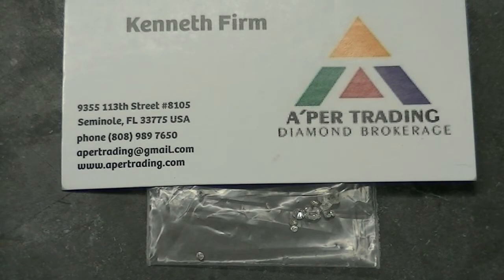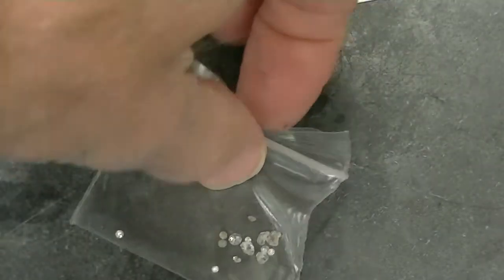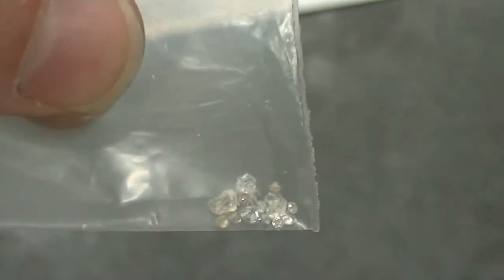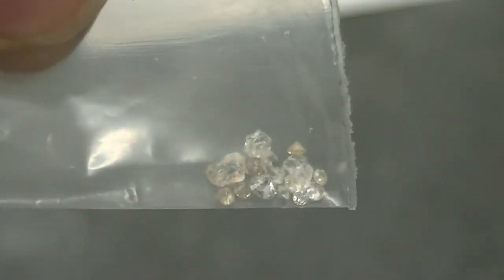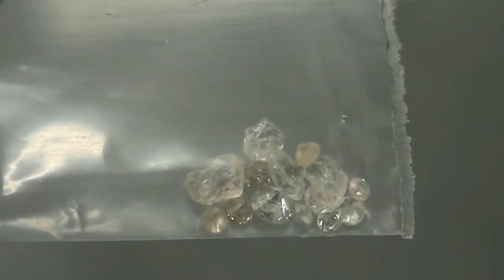Let's test to see if diamonds can be burned in oxygen and air, with some inexpensive diamonds I bought from Aper Diamond Company. These diamonds are inexpensive because they have imperfections in color, quality, cut, or things like that. I purchased the diamonds you see in this bag for $50.